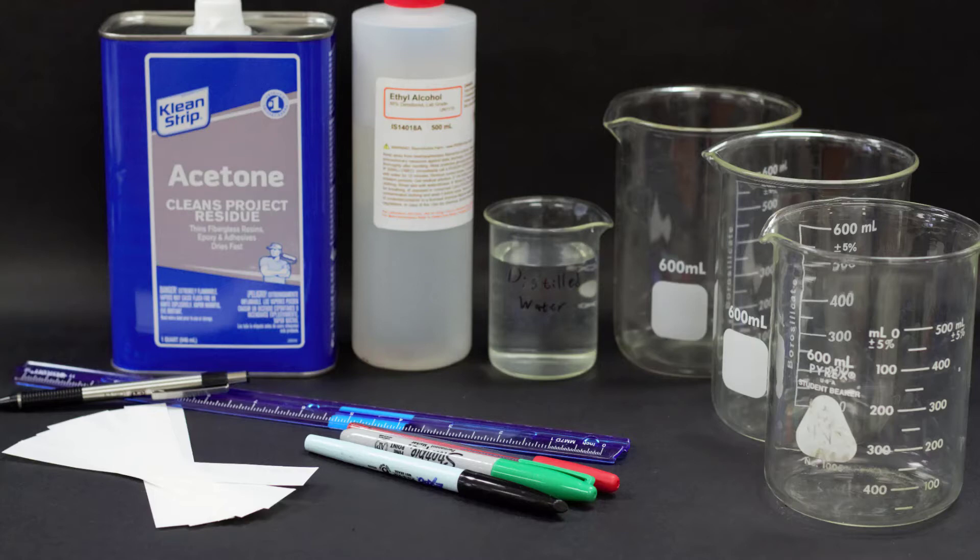You'll need nine strips of chromatography paper, three 600 milliliter beakers, several pencils, a ruler, and some masking tape.